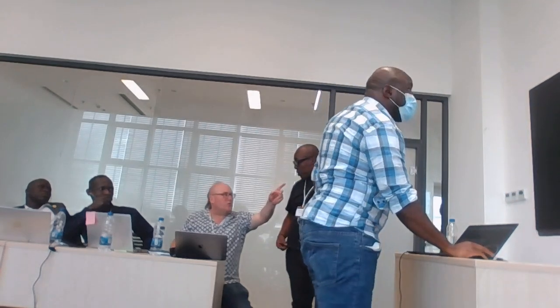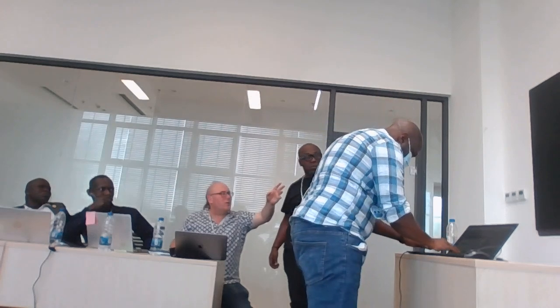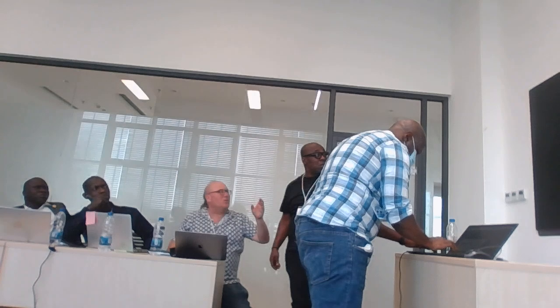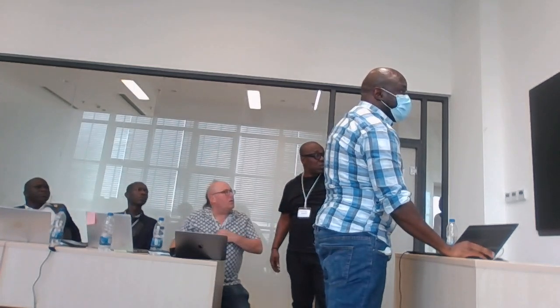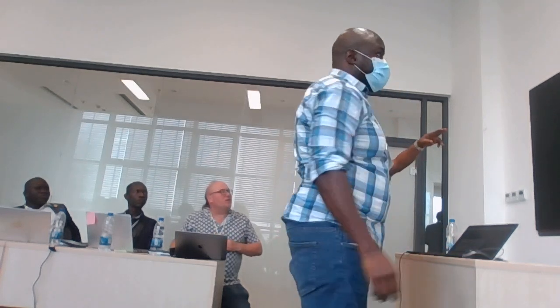And then can you just explain one more thing about that? This is a B1 reference, which means that the samples are very similar. B1, what is this one? But the B1 reference was collected recently. But if you look at the clade, yeah, but that's a little bit of a complicated explanation to explain to people. It still helps. And yes, I know, but still. This can be good for translating. Okay.